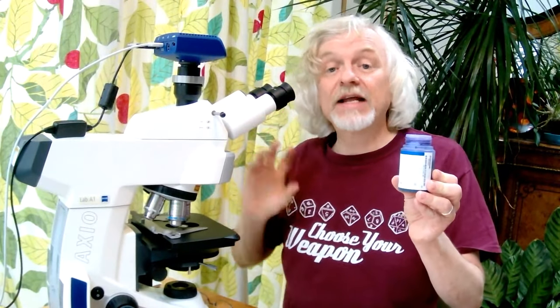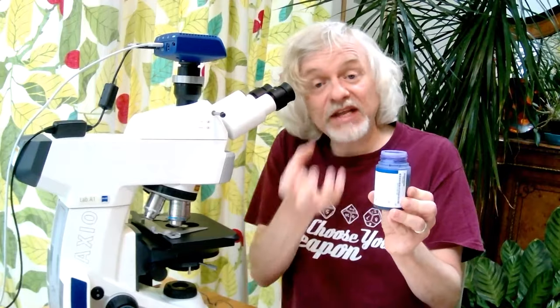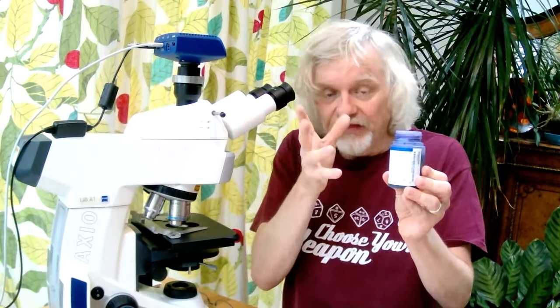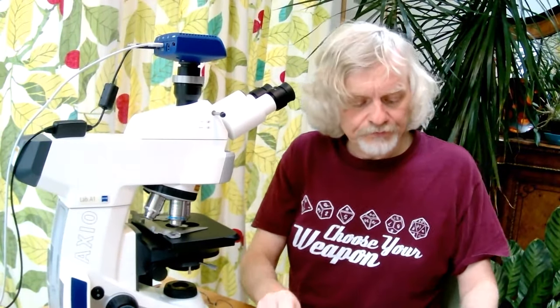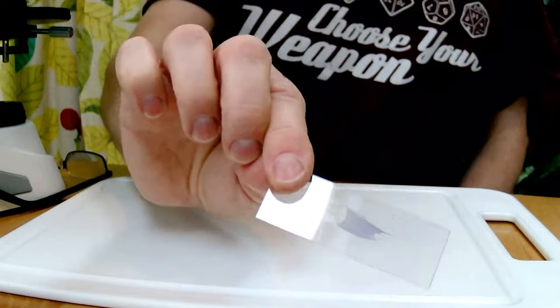And this one, the blue one, well, it stains a bunch of things, but the thing that we're interested in is that it will stain the nucleus. So inside every cell, there's the control centre. It's kind of like the cell's brain. So we've got individual cells, and inside each cell, there's the control centre, the cell nucleus, where the DNA is and the genetic material and all that fun stuff is going on. So there we go. It's dried out already.